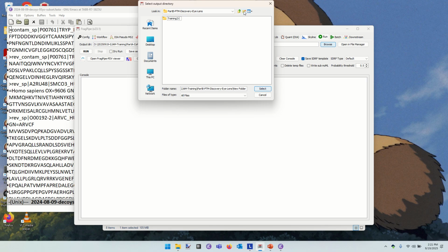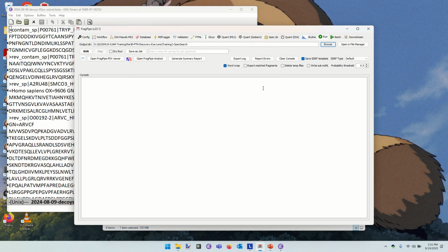Training 2, open search. It's a fine name, we'll go with it. Training 2, open search. And I want to delete temporary files, and I think that's basically it. Now I'm going to go ahead and click run, so this goes ahead to launch.